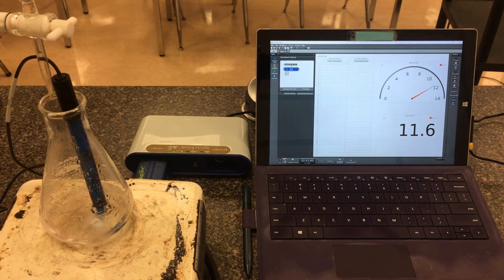So I'm noticing that that pH there is staying fairly steady. This base here isn't overly concentrated, so I do expect a rough pH around there to steady out. I've just taken down a few data points so you can get a sense of what that ending looks like here, but we definitely had some equivalence point here where that pH you saw jump really, really quickly.